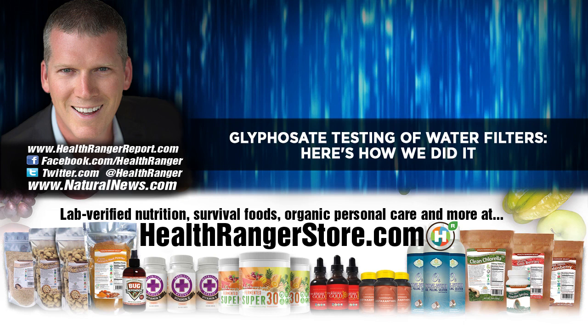It's very complex, actually. And most of the glyphosate methods that have been published in the scientific literature, and we've tried most of them, by the way, they don't work. They don't work because, well, number one, a lot of the older methods use what's called post-column derivatization, which requires this processing step following the chromatography to alter the glyphosate chemical using other chemical compounds and so on, to make a new chemical that will show up more easily on a mass spec instrument. It's a very difficult and toxic process.